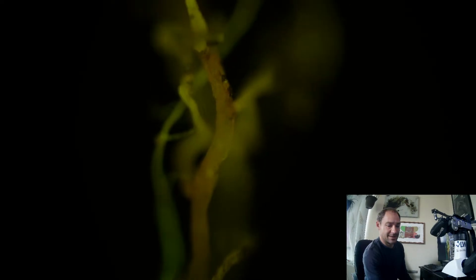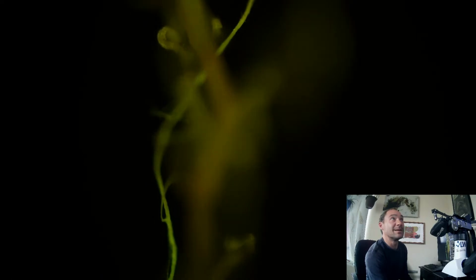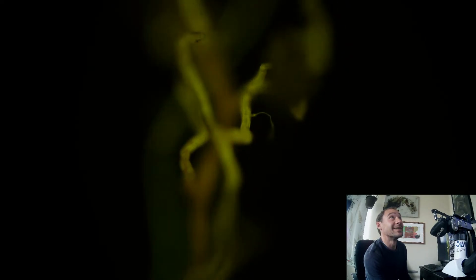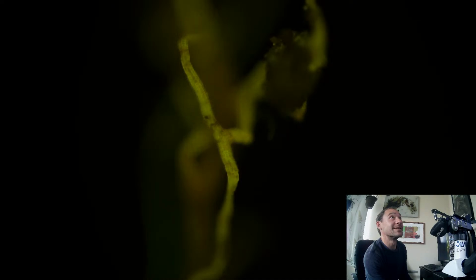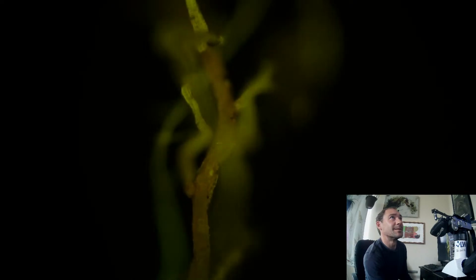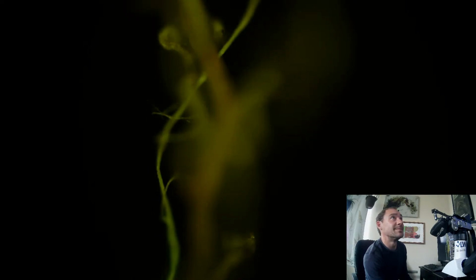Trying to see if we can get maybe right over. Oh, that's a little too high. Maybe this part. See if we can find any more really cool parts to look at. But yeah, that's all. It all just twists up. It looks like to the naked eye like this is just one strand of root, but it's actually a twisted mesh of roots. Yep, blueberries are pretty cool.